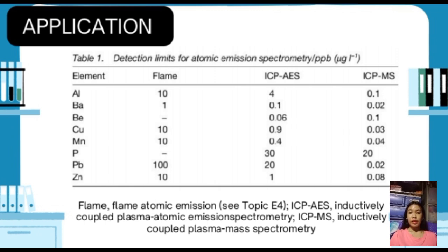And interference, naman po, the presence of a large excess of electrons in the ICP helps prevent significant ionization interference, which can be a limiting factor in other methods. High temperature: the extremely high temperature, typically around 6,000 to 8,000 Kelvin, in the plasma effectively reduces interferences from molecular species and the sample matrix. This environment facilitates efficient excitation of elemental species and improves sensitivity and accuracy.